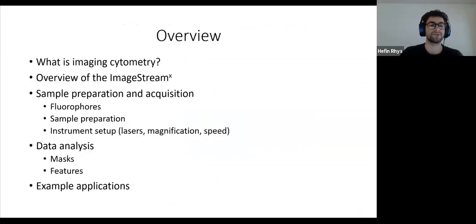I'm just going to give a brief overview, an introduction to what I mean by imaging cytometry. And then I'm going to talk a little bit more in detail about a particular imaging cytometry platform that we have a lot of experience with at the Crick called the ImageStream. Then I'll talk about some best practices for sample preparation and acquisition for an imaging cytometry experiment, talk a little bit about data analysis, and show you some example applications and some data that's been generated by people at the Crick.